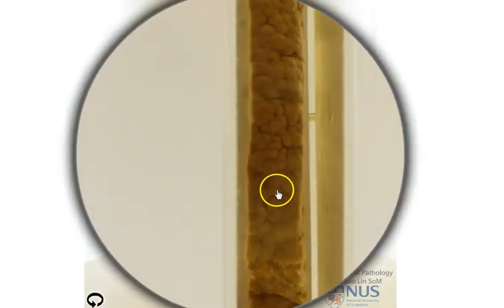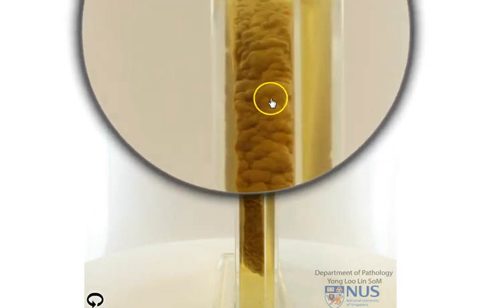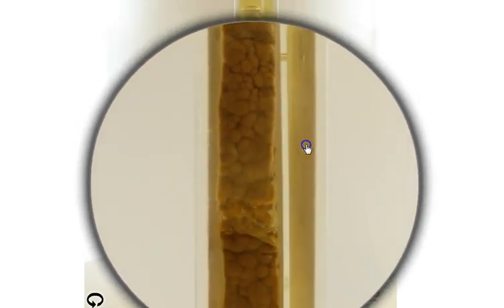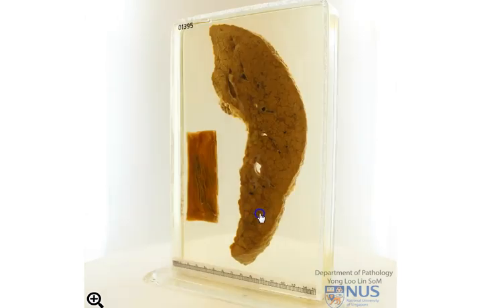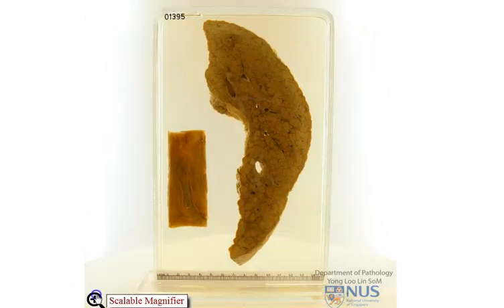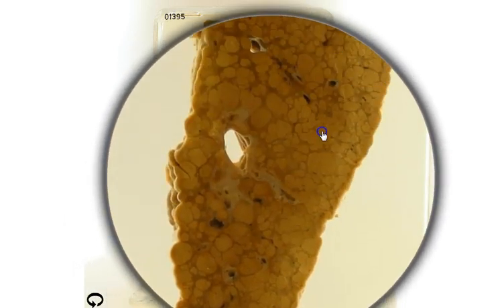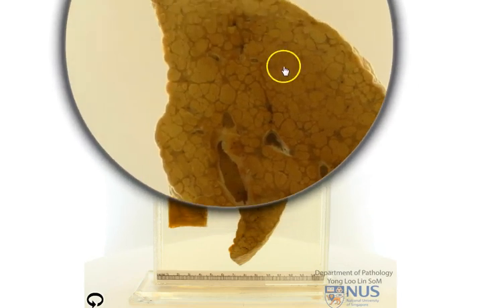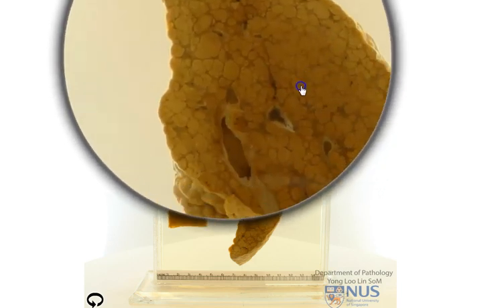Looking at the capsular surface, if we look up and down, we can see that the capsular surface appears somewhat irregular and nodular, and this is present throughout the entire slice. Coming back to the original surface and taking a tour of the cut section, we want to decide whether this is a discrete or a diffuse process. As you can see, this abnormality in architecture is present throughout the entire slice.